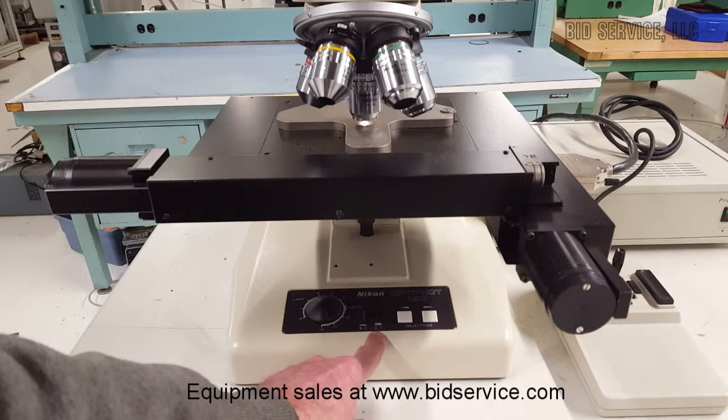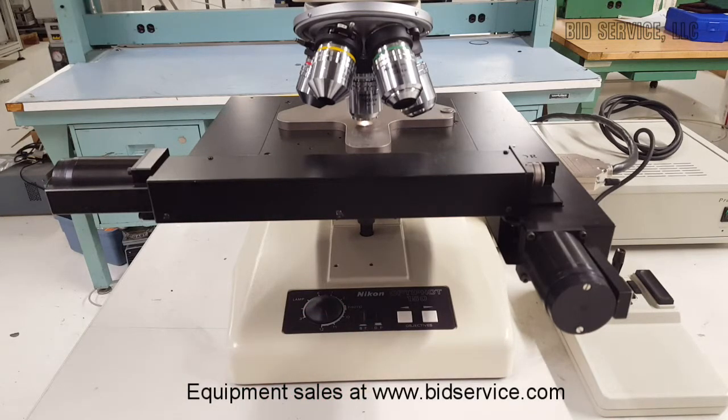This bright-field/dark-field button here is an optional button for an option.